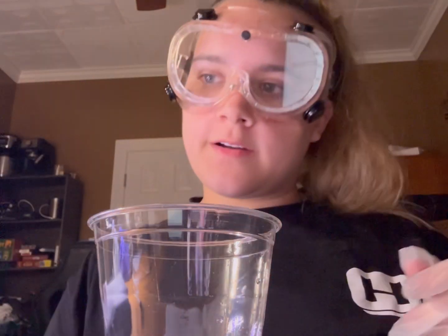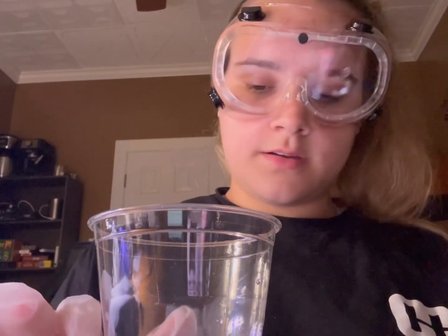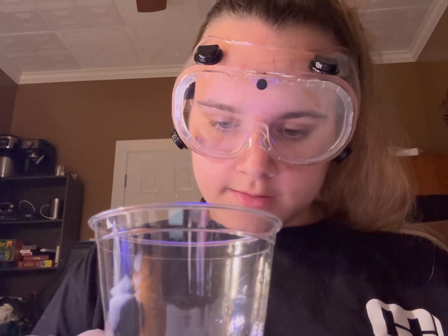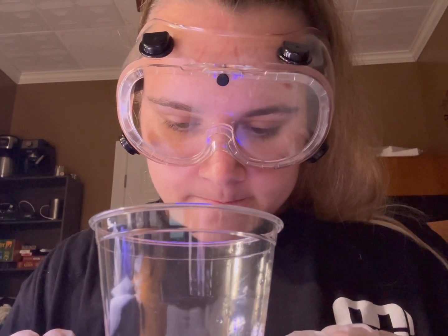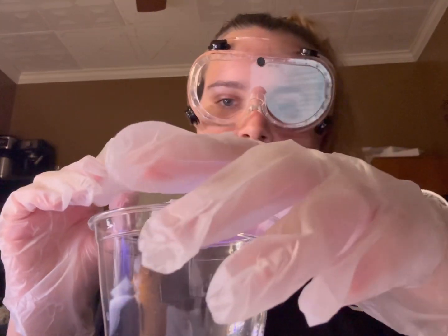And now we will move on to experiment 2, our final experiment, which is the freezing point colligative property. And so we will measure 100 grams of ice in this cup. So let's turn on the scale and set it to grams. Alright, now we'll start adding ice to this cup.